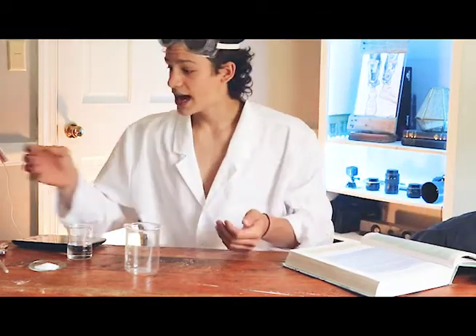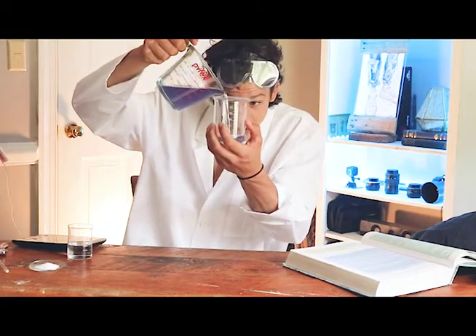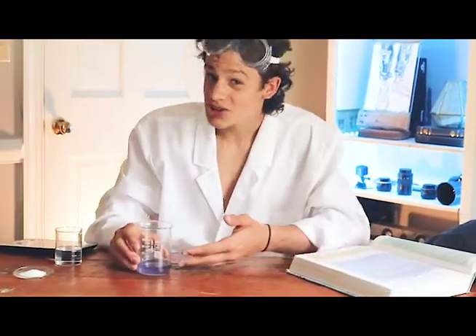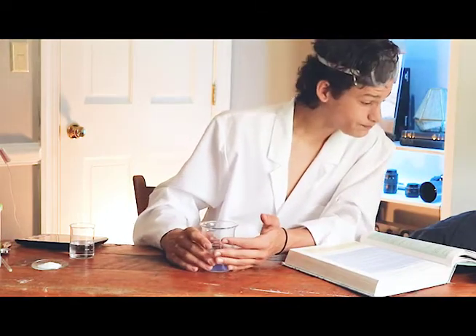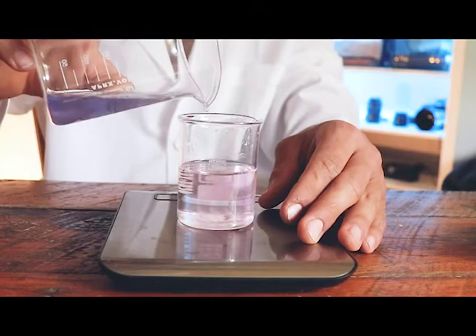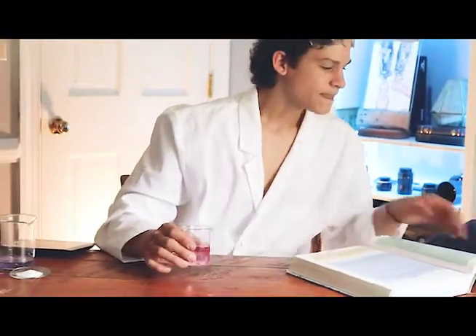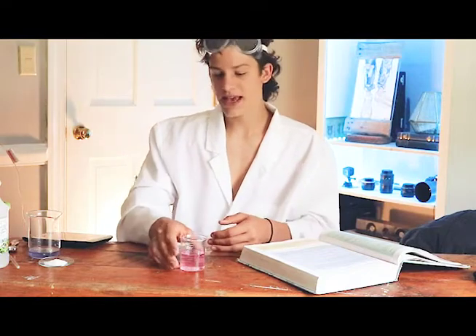After we have our cabbage water, pour about 50 milliliters into the 250 milliliter beaker. Your cabbage water might be pink — mine turned blue, though either way it works. Then pour about 10 milliliters of this into the beaker with the vinegar — measure up to the 70 mark. You can see the vinegar has now turned pink, which is because chemicals in the cabbage leaves create a chemical change.